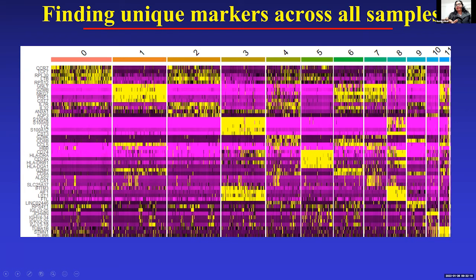And where I see IgG genes, probably these are the B cells. And likewise, wherever I see J chain highlighted, these are the plasmablasts. So this helps us annotate which cell type they belong to based on the gene signatures.